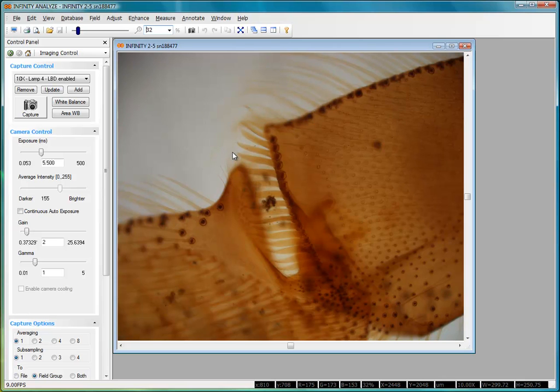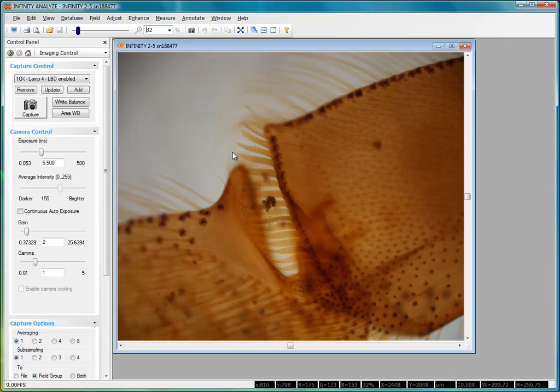If your computer mouse is equipped with a scroll wheel, you can use it to zoom in or zoom out on whatever image has the most focus at the given time.